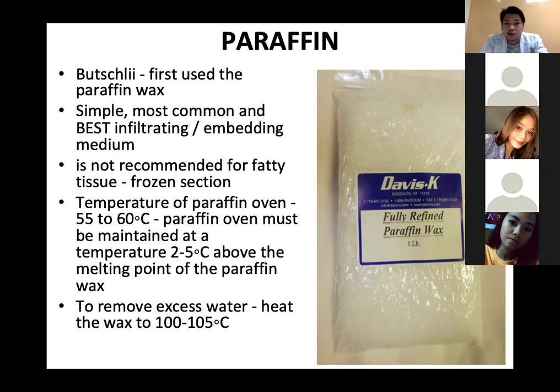He was a zoologist and a chemist, and he used paraffin before to dissect insects for studies. So paraffin is simple, and it's the most common and best infiltrating and embedding medium.